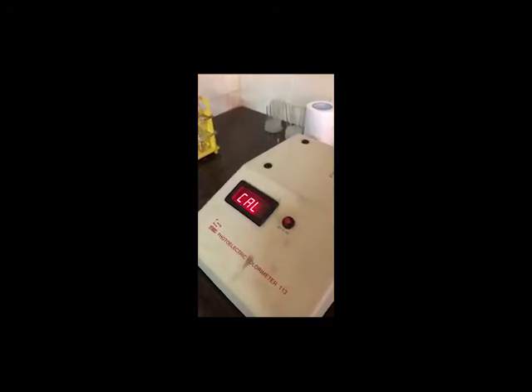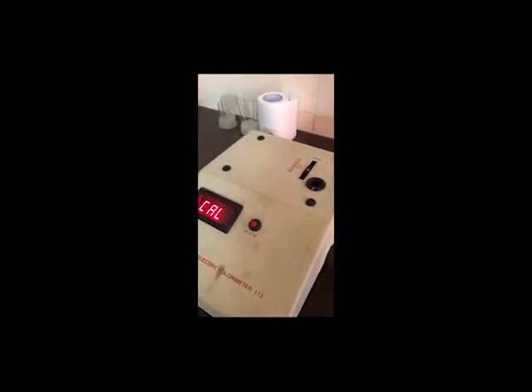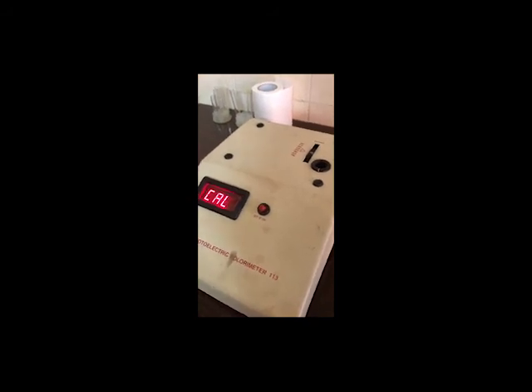Next, we look at the samples to be measured. Here, we are going to measure the concentration of sugar using the phenol sulfuric acid method. The standard is prepared using phenol sulfuric acid. You can see the standards go from a lower concentration to a higher concentration. From this, the OD of the standards will be obtained. The concentration as well as optical density is obtained through formula as well as graphical methods. We can calculate the test concentration by measuring its optical density.